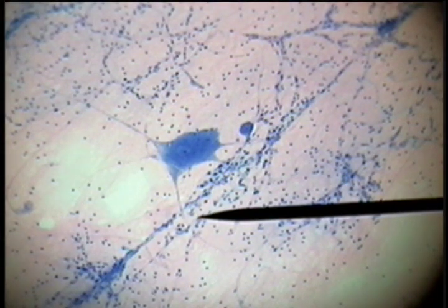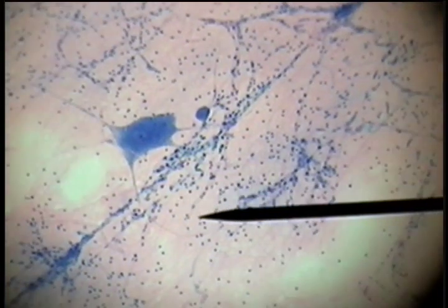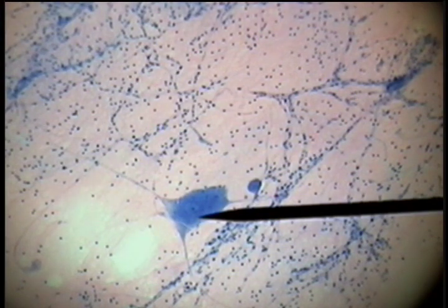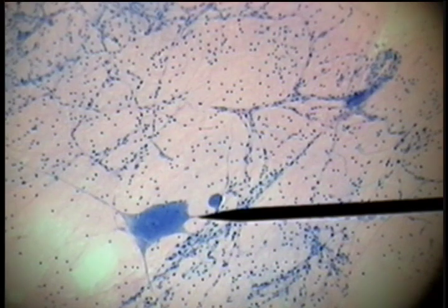If a smear of ventral horn of the spinal cord is made on a slide, large multi-polar or giant multi-polar neurons that are motor neurons can be seen. This large basophilic or blue cell is the cell body, or nerve cell body, and the processes extending from the nerve cell body — this may be an axon, this may be a dendrite.